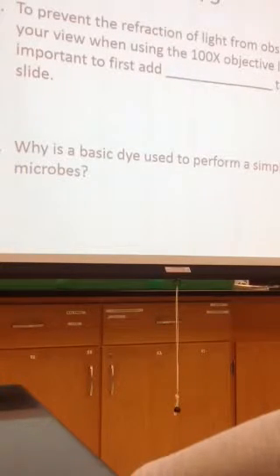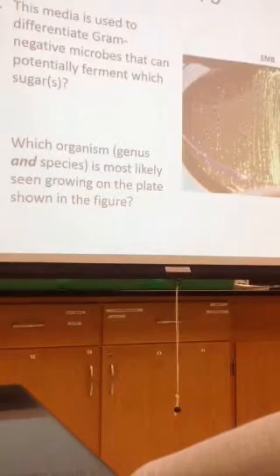If you try to do this in a couple of words, you say, why is a basic dye used? Because it sticks to the bacteria. Okay? That's really the best answer. It sticks where acidic dye would not stick. Fair enough? All right.